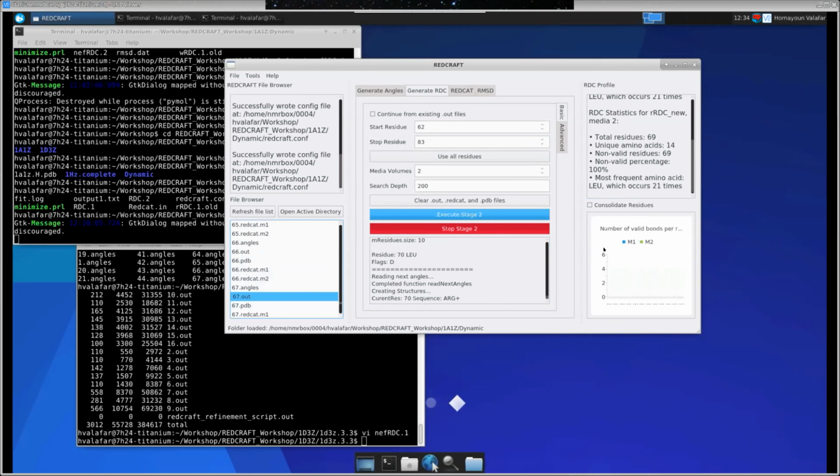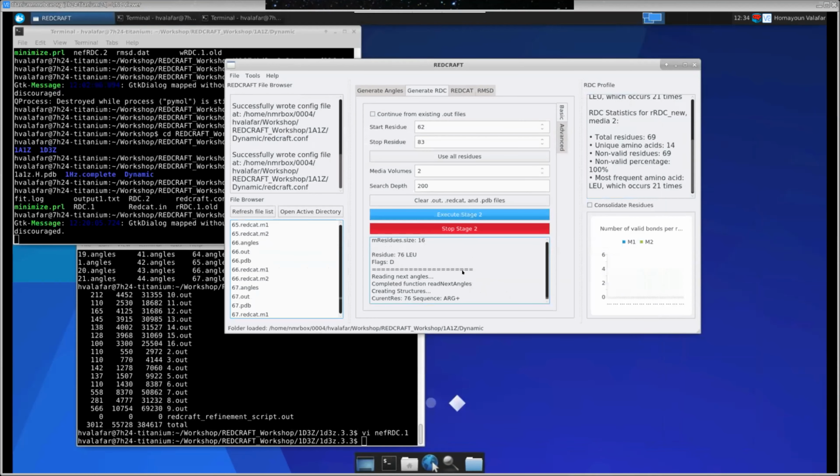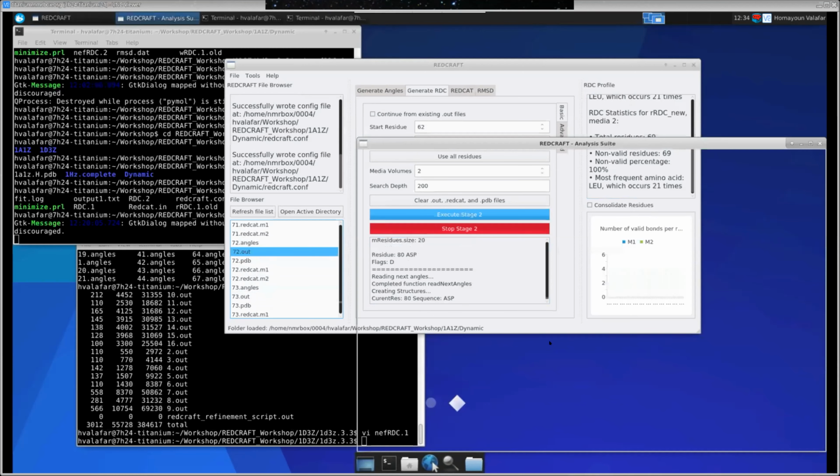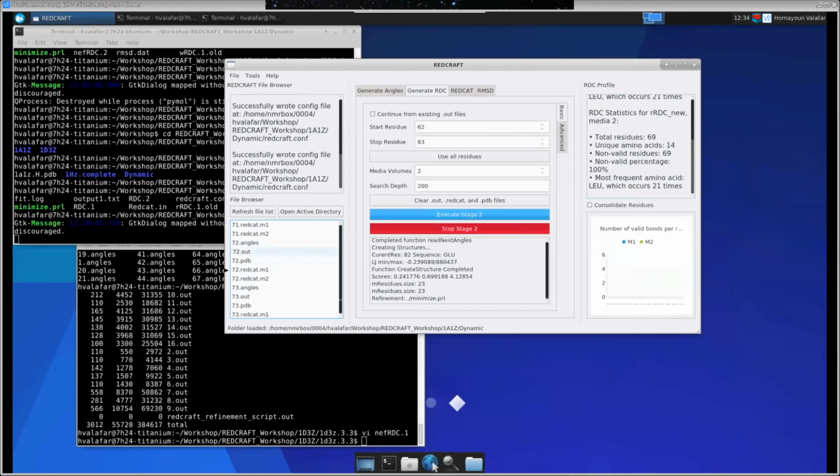first look at the output. The output shows the typical pattern, that's here, by the way, it's starting at 60-something, it shows that incrementally going up. If you look at it further, you'll see that it exhibits the same pattern of monotonically increasing and then plateauing. So I'm at 78 now, so let's look at 72. So you can see that it plateaued here, indicating you're getting a structure. And the question is, am I getting a good structure?